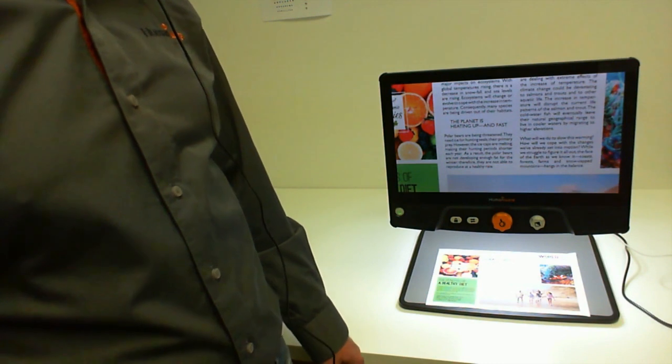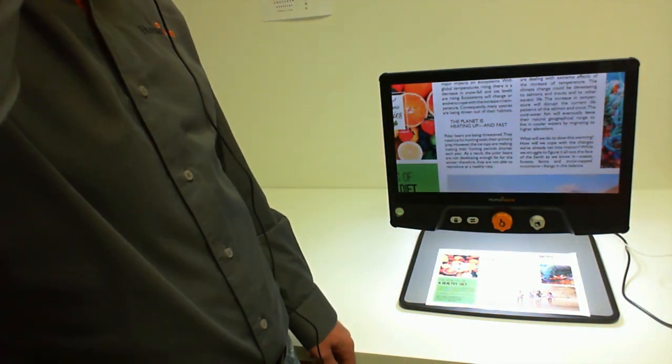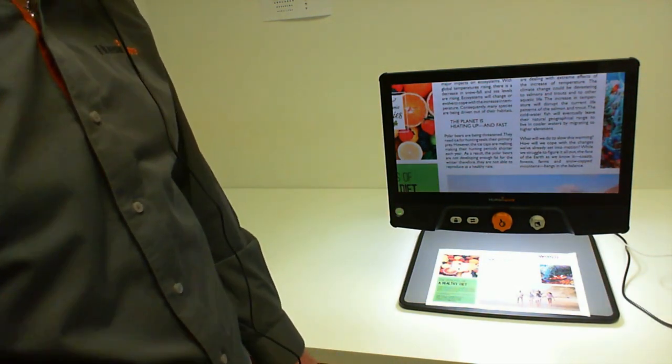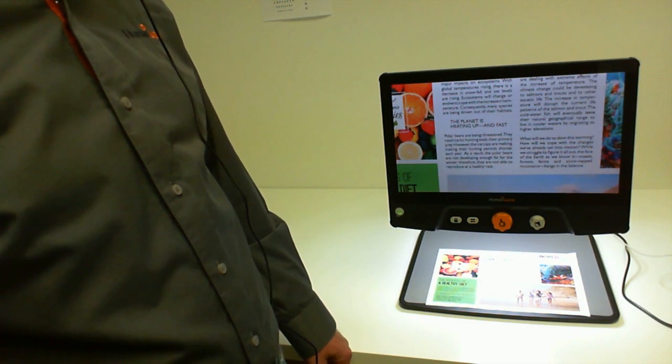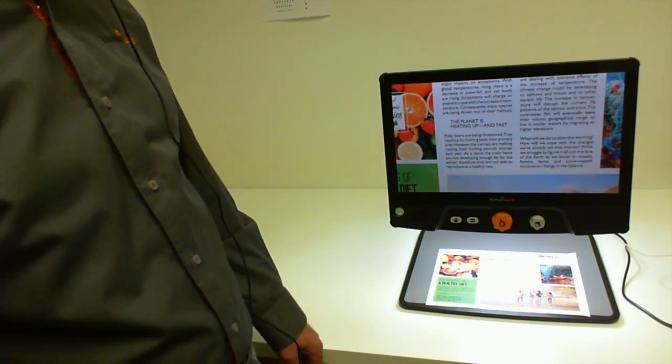In today's little tutorial, we'll see how to operate the Reveal16i. Reveal16i is the big brother of the Reveal16. It is the same thing as the Reveal16 except with all the intelligence using Prodigy.